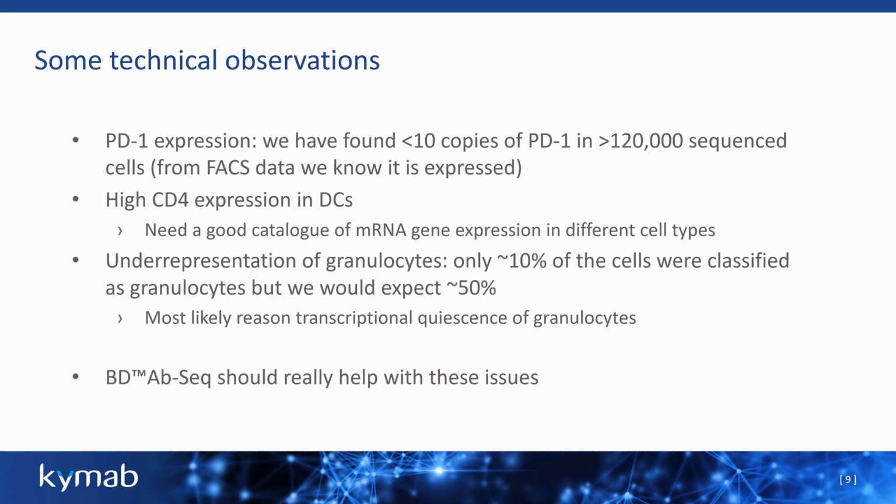However, we've found less than 10 copies of this gene in over 120,000 sequenced single cells. And from FACS data, we know that it's expressed, obviously it depends on the cell type, but it's expressed to quite an appreciable level.